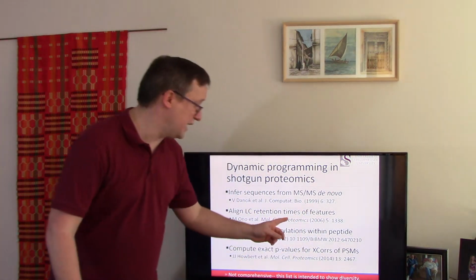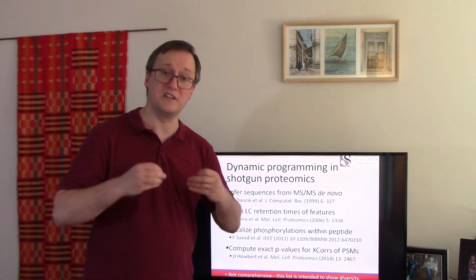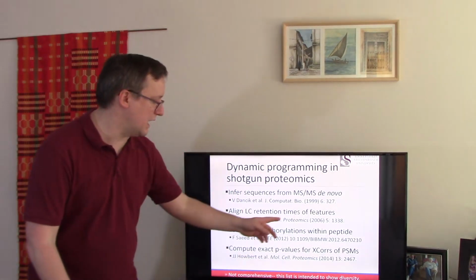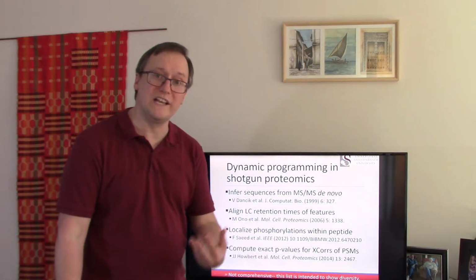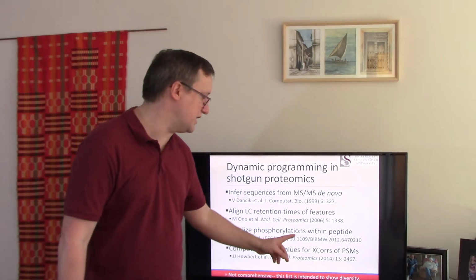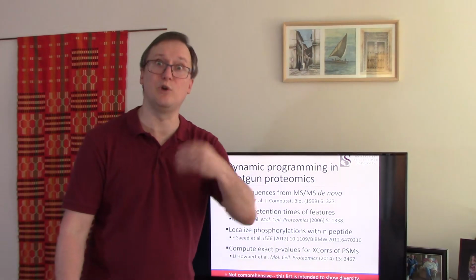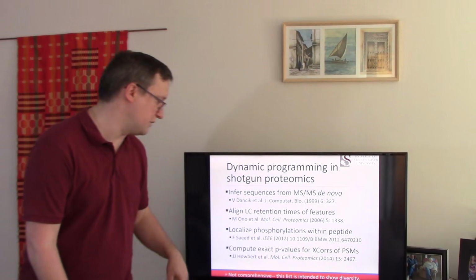So here the paper from Ono et al. in 2006 demonstrated that this kind of approach for mapping retention times among raw files, among LC-MS/MS data sets, can be accomplished through dynamic programming. Certainly, localization is a very big deal when we're dealing with post-translational modifications, and even in shotgun datasets, we see that people have shown ways to apply dynamic programming to find the optimal localization of these modifications given a peptide sequence. That was published just in 2012.